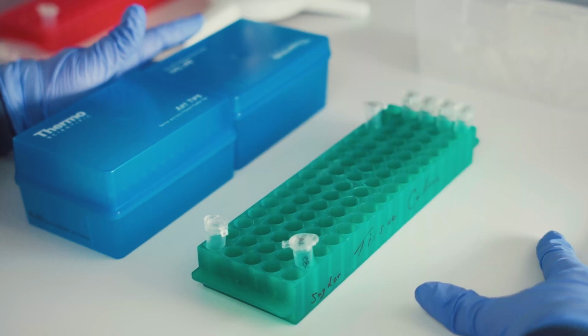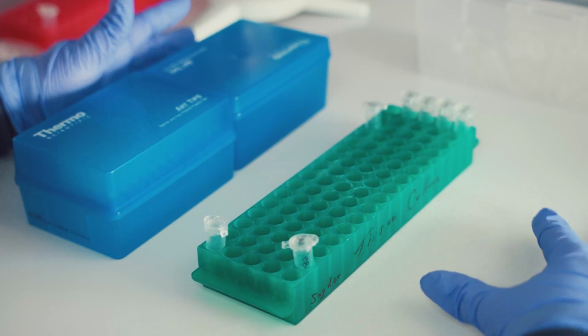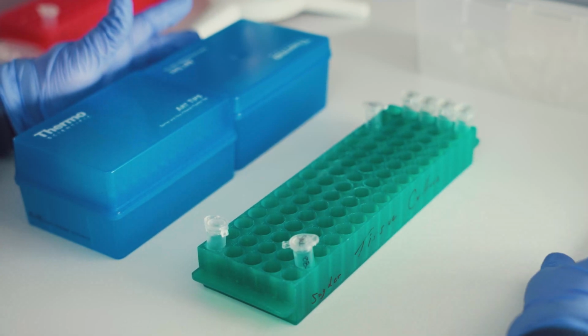Prior to beginning your DNA dilutions, ensure that your specimens have been extracted using your preferred extraction method, and make sure all solutions are measured for the nanodrop concentration. You want your specimens to be more than.